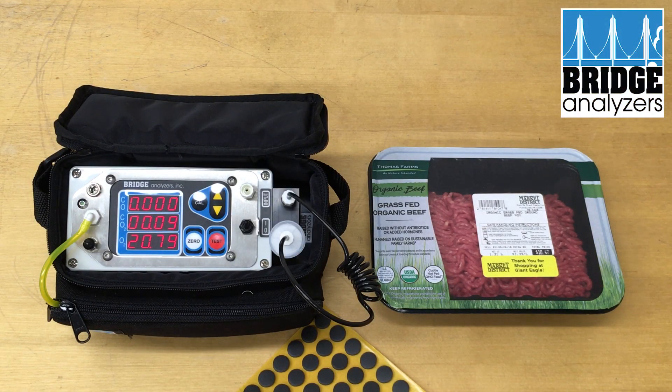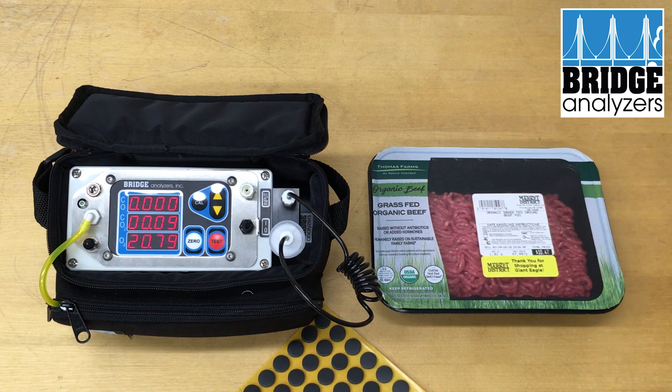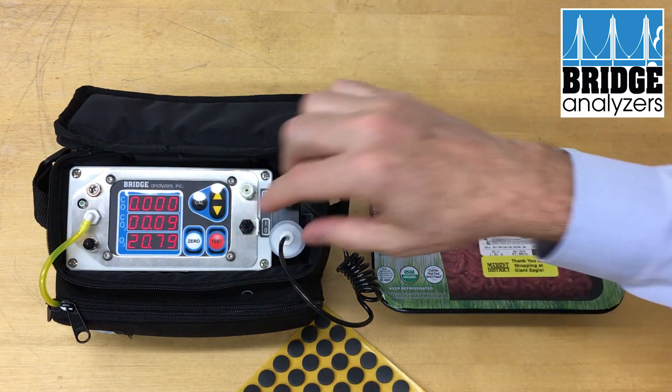In this video we're going to show a Bridge Analyzer tri-gas analyzer doing a single discrete test on a ground beef package. This would be case-ready meat in a package that has been gas flushed. The analyzer is turned on, zeroed, and ready to test.